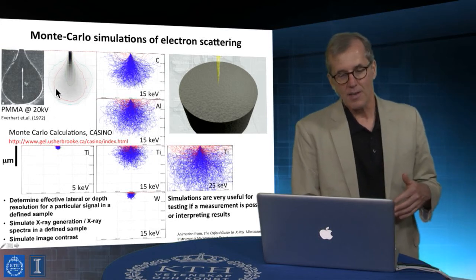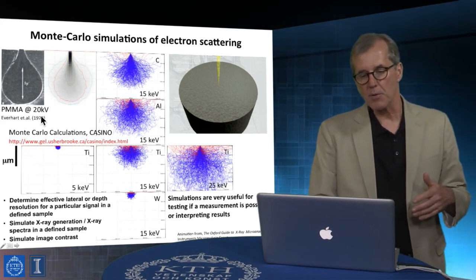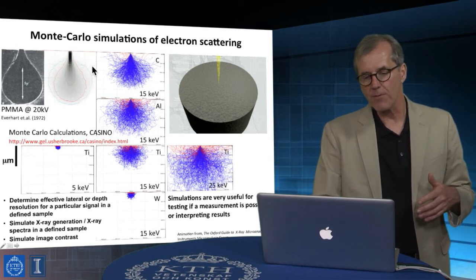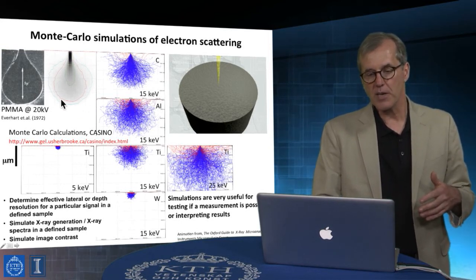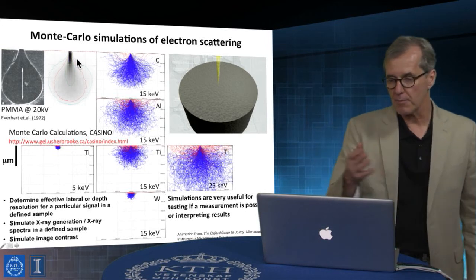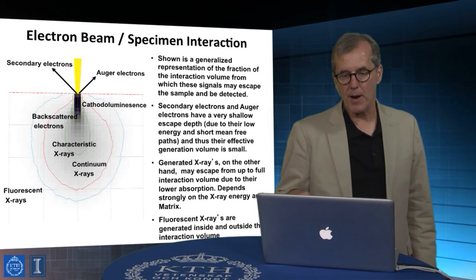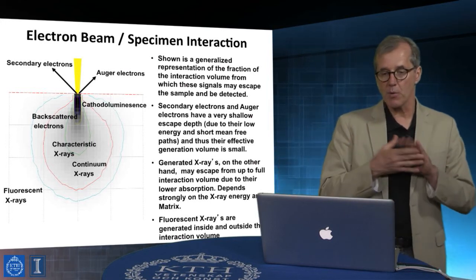Okay, and this was a 20 keV excitation. You notice that it very closely follows the energy dissipation profile that comes out of these simulations. Okay. So it's a really powerful impact. Now let's go into that in more detail.